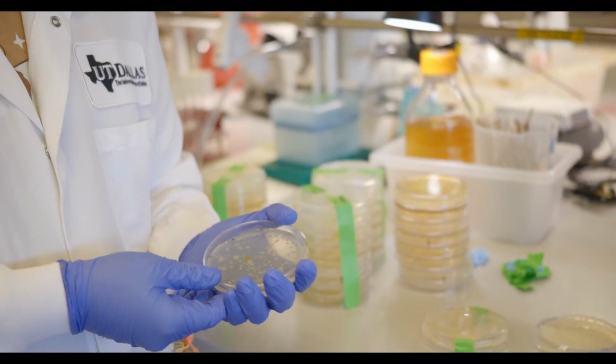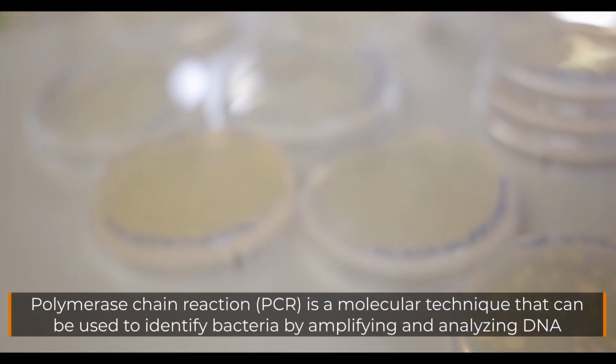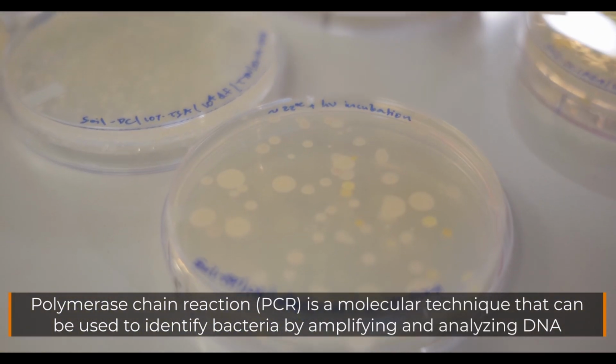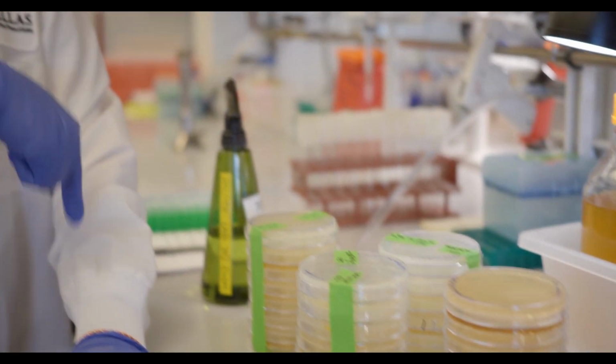Now, how do you identify what is happening? One of the experiments that we do later on is PCR testing for a specific gene called the 16S RNA gene, which is a gene that's typically conserved and unique to bacterial species, one of the techniques you can use. And then we're going to use that to be able to identify the bacteria.